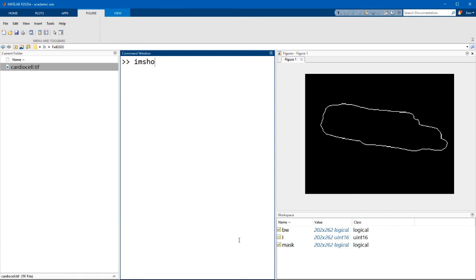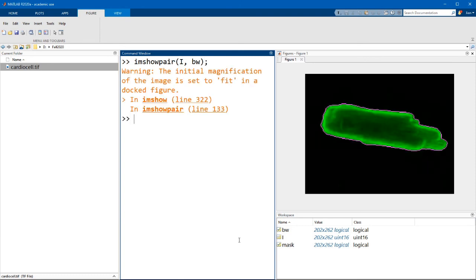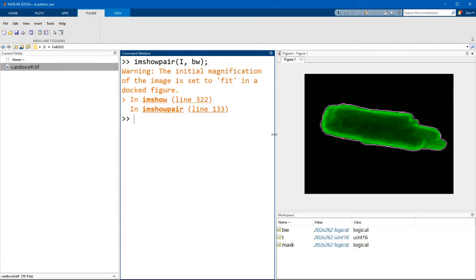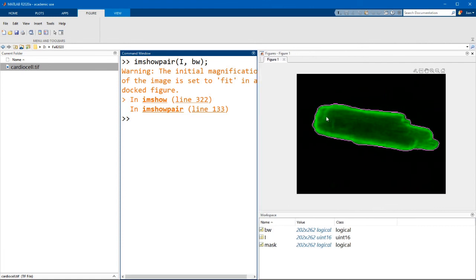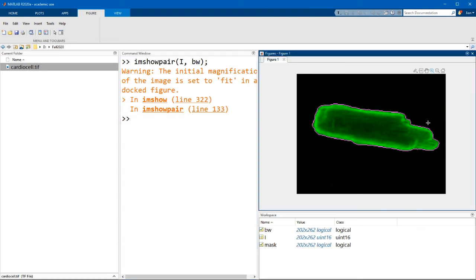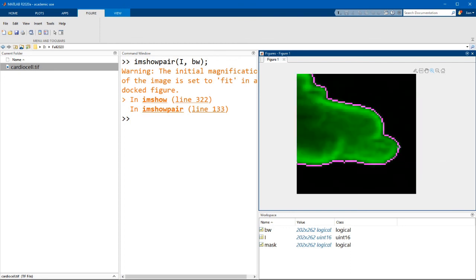So let's type in imshowpair i, bw. And you can see that in this image, we have the cell shown in green and the perimeter mask shown in magenta. This is how you would validate the mask by zooming in to this image and checking to make sure that the outline in magenta fits the outline of the cell.